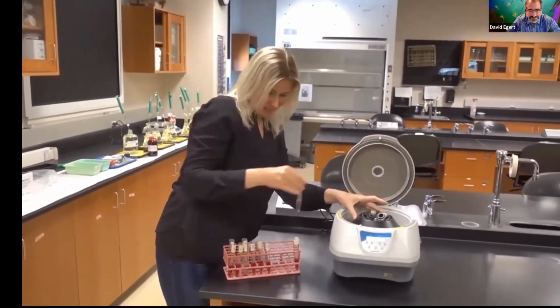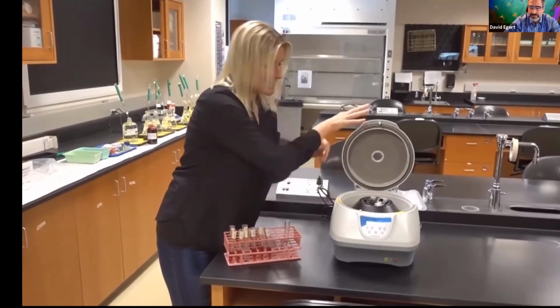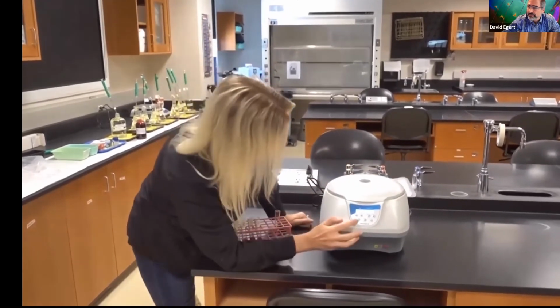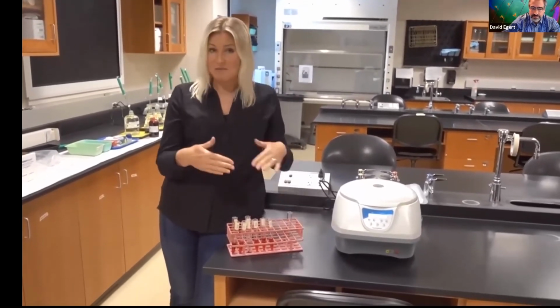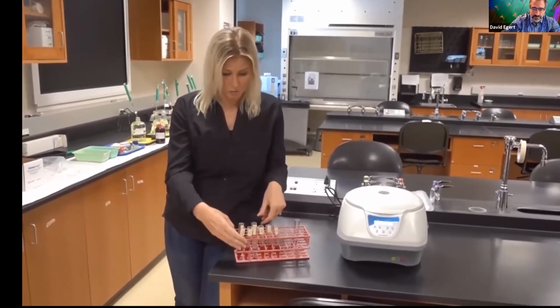So in this case, since I do have our special number 9, I'm going to stick it here, and they're right across each other, and we can start this centrifuge up one more time. And we'll come back in 5 minutes and take a look at that. Now I'm going to start taking a look at what's happened in my other tubes.